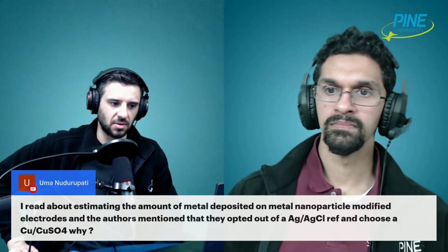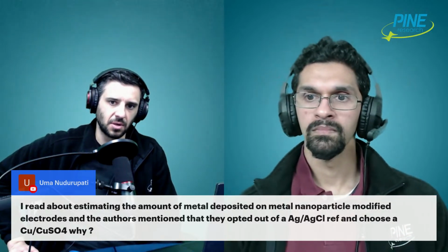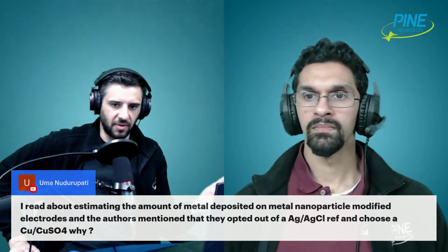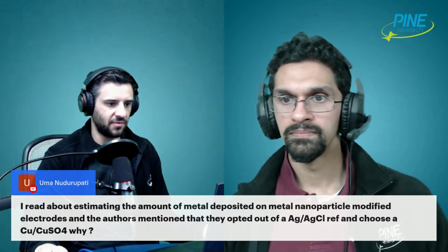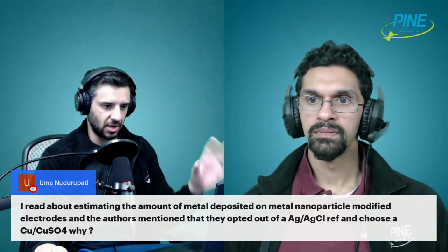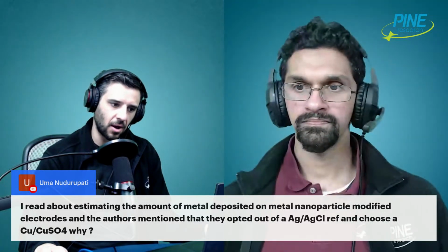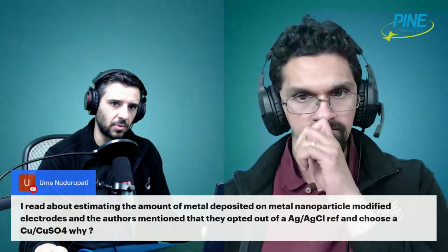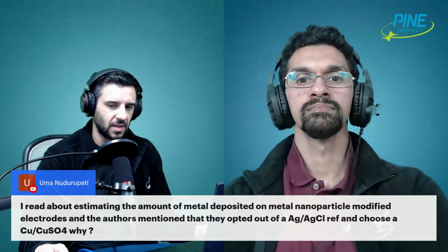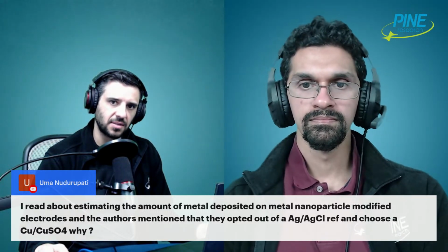The reference electrode's connected in the potentiostat through an electrometer with a very high impedance, so it's not taking part in the reaction other than just being a stable reference point. But if there's worry, especially with nanoparticles and measuring very small sensitive concentrations, they might be worried about silver somehow coming in contact. But it could also be a chloride thing. Chloride, for instance, can be sticky and clog up electroactive sites.